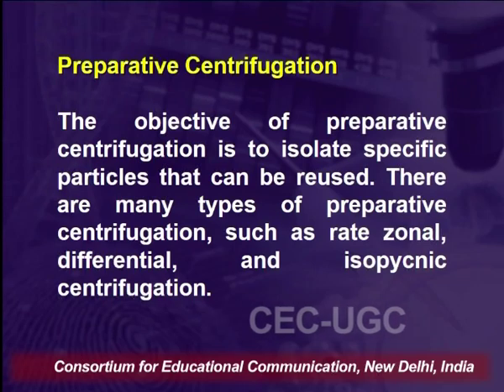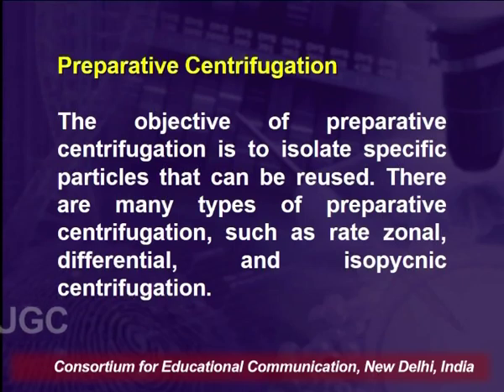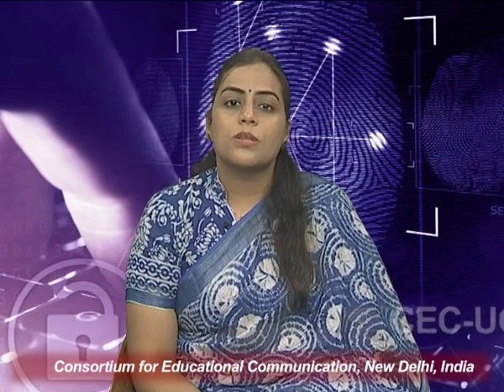As we say, there are many types of preparative centrifugation, for example rate zonal, differential, and isopycnic centrifugation. All these techniques are based on the simple principle of the centrifuge and centrifugal force. The centrifuge is a piece of equipment which is generally driven by an electric motor that puts an object in rotation around a fixed axis, applying a force perpendicular to the axis, to separate substances of different densities.